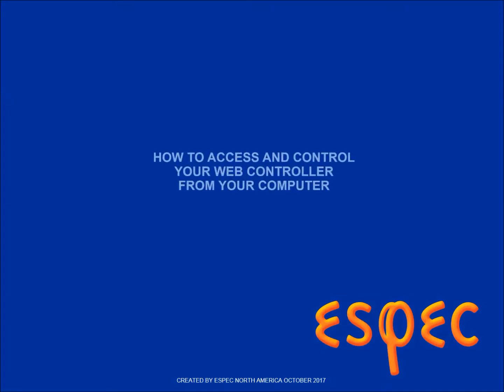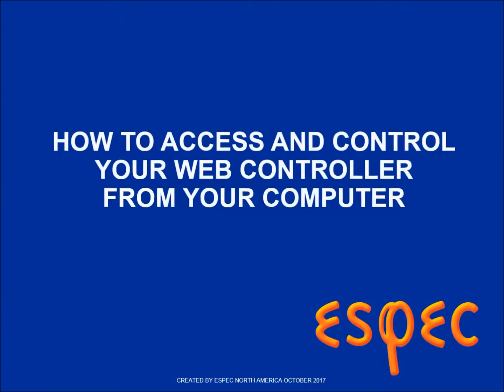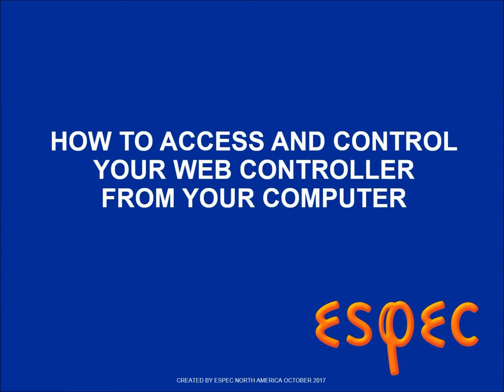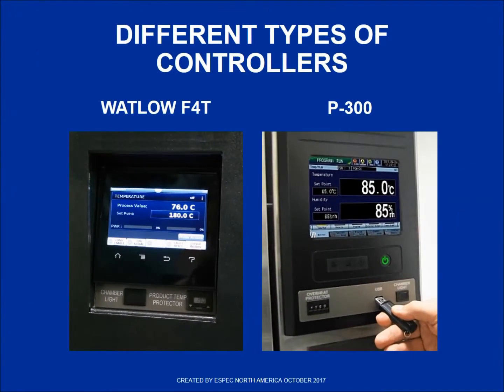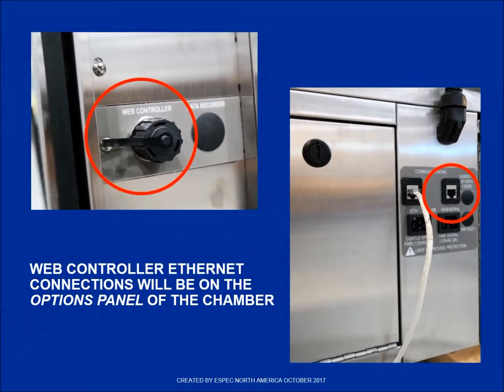This video will teach you how to access and set up the web controller connected to your ESPEC environmental chamber. Different chambers have different types of controllers for adjusting temperature and humidity conditions. It is possible to have a controller and not have a web controller. If you have a web controller, you will have an Ethernet connection labeled web controller on the options panel on the side of your chamber.